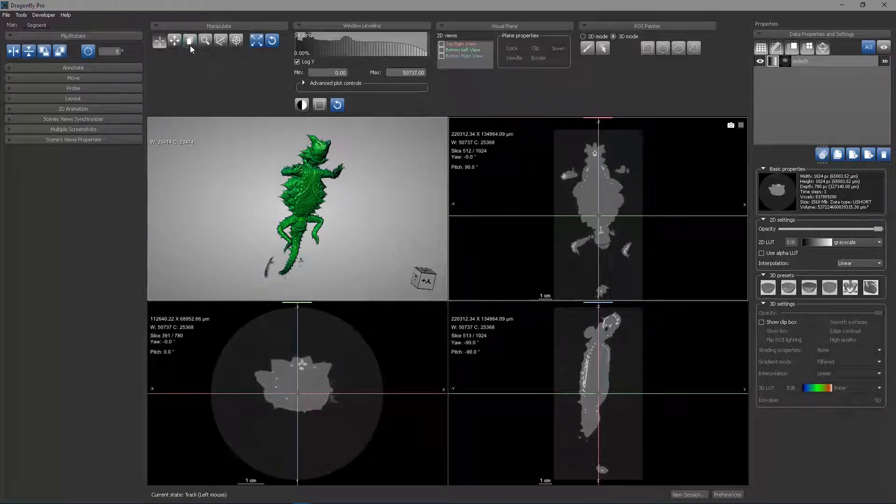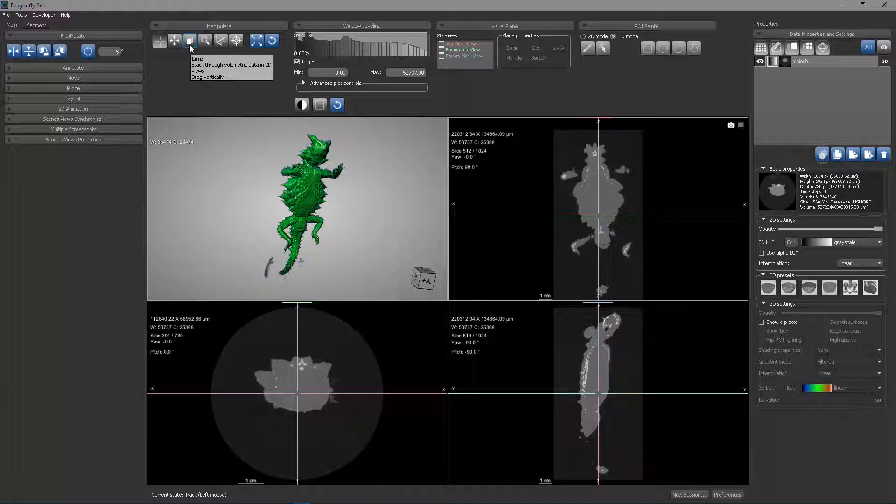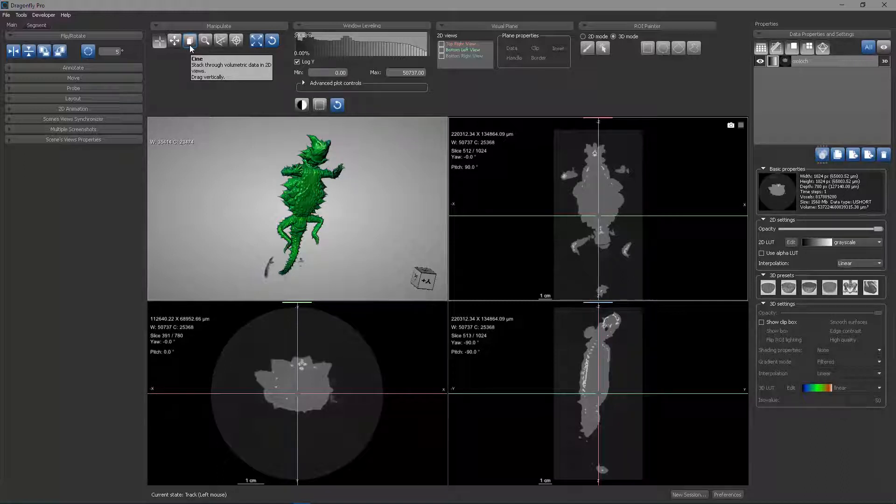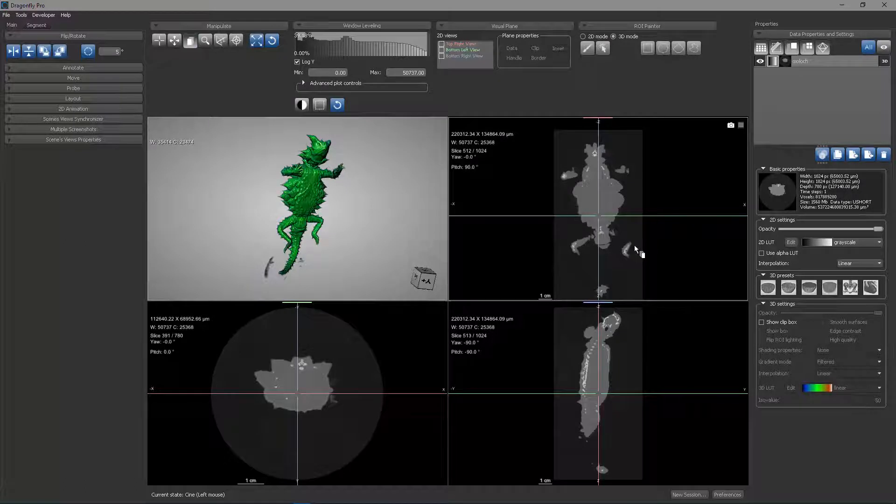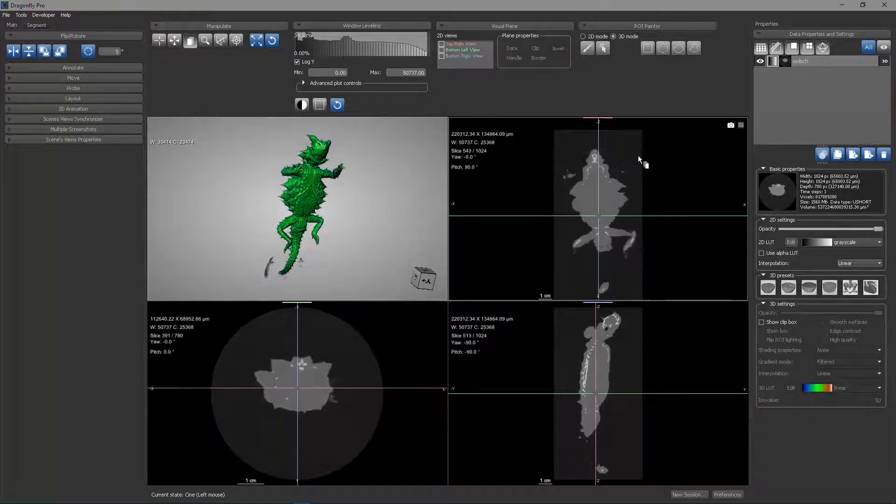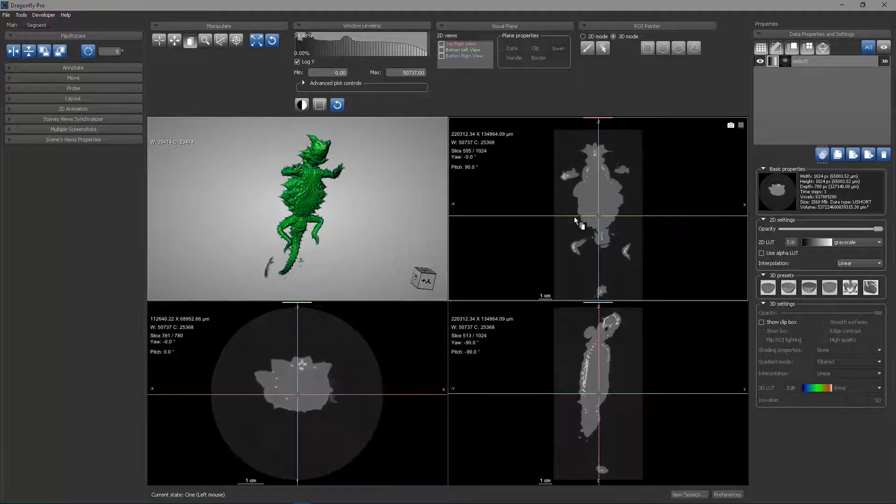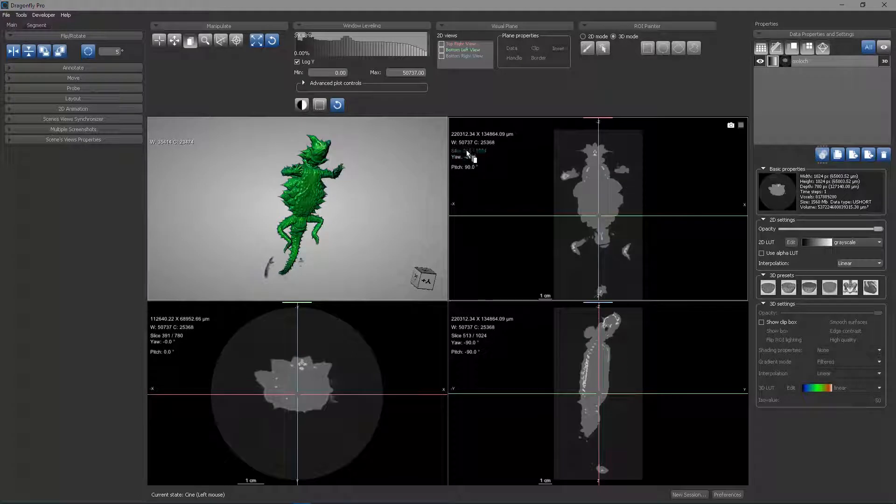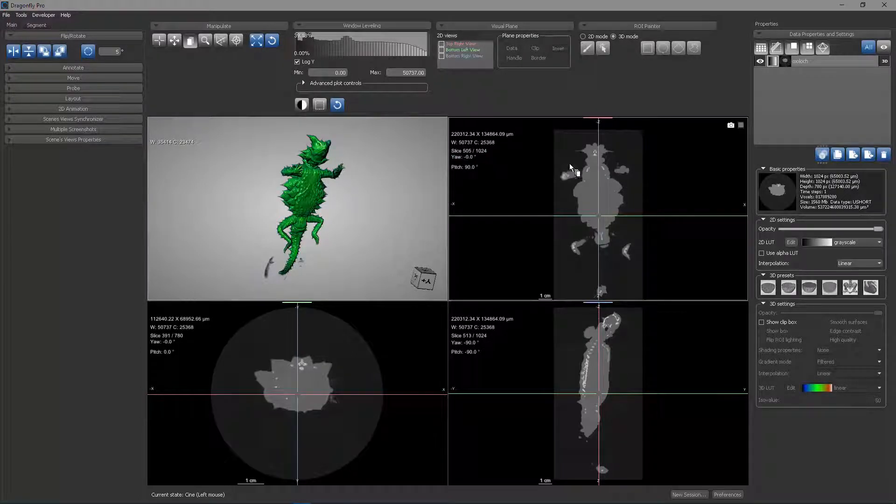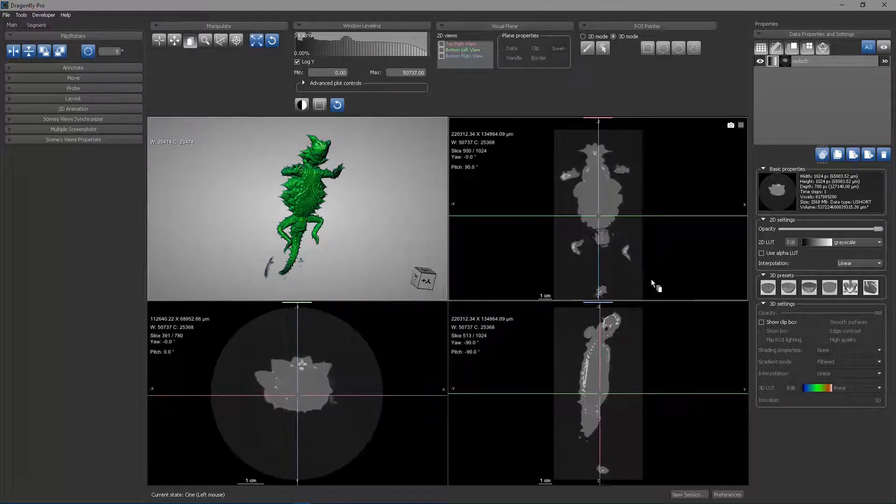The next state on the manipulate panel is the Cine state, which allows you to slice through volumetric data in 2D views. This allows me to drag vertically to scroll through different slices. You can see here, slice 505 of 1124 changes as I drag up and down.